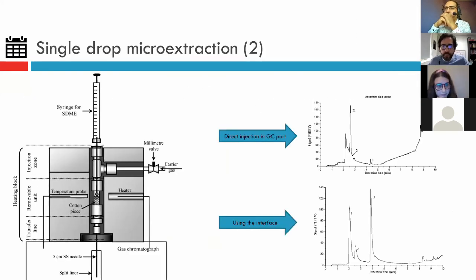So this is the device that we use. This is the interface that we designed using Swagelok elements. So it is very simple to design.